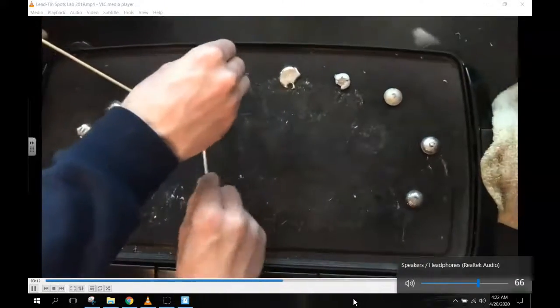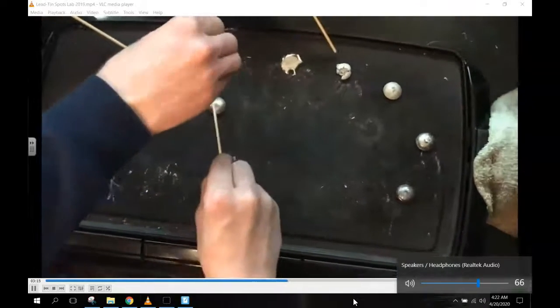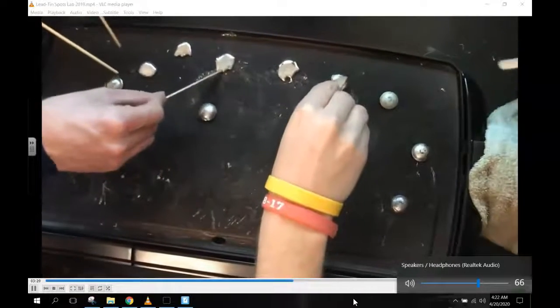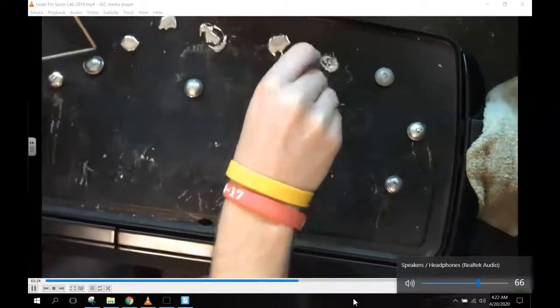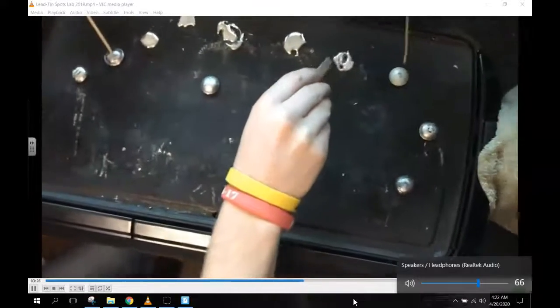So those metals, when they're hot, they're reacting to the oxygen in the air. The black is that oxidation. Yo, was this me? Yeah, I did that. That's number 4, right? And I poked it and it shattered. Number 4 went. Oh my gosh. Look at number 11.